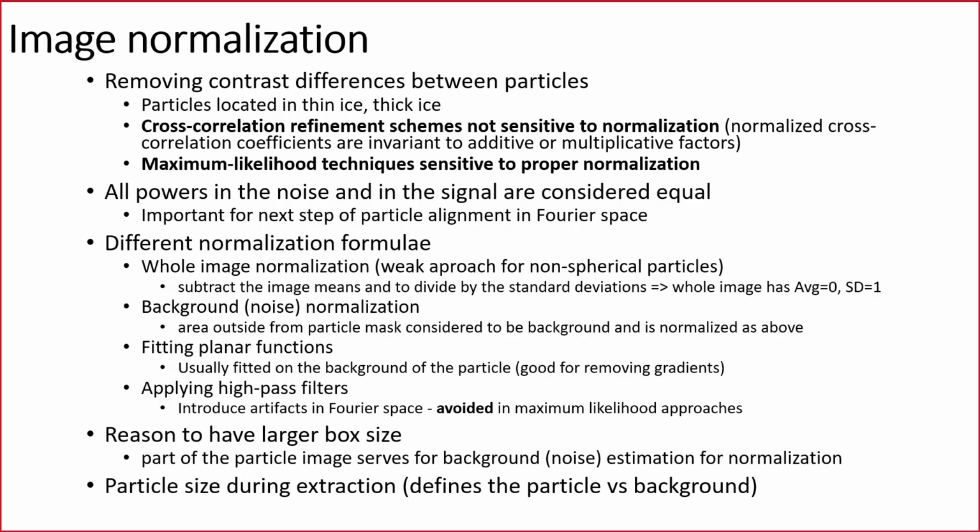Or we can fit a planar function. Also, we can use some filters like high-pass filters, but this should be, again, avoided in maximum likelihood approaches because it creates some artifacts in the Fourier space.